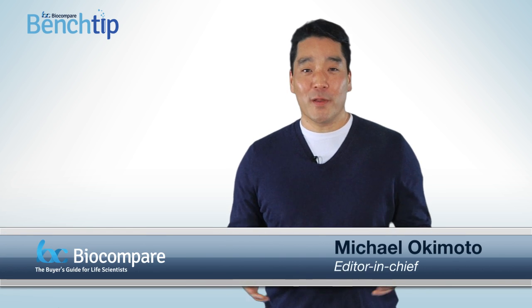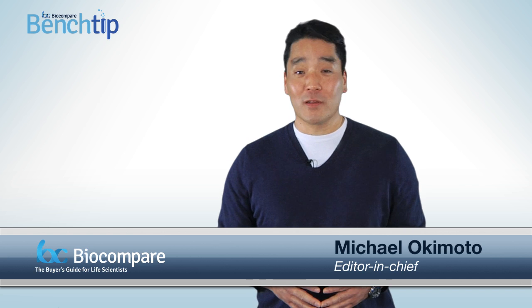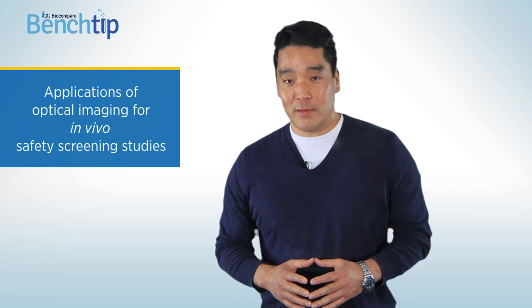As always, our video bench tips are a chance for us to talk about developments in the tools and technologies available to life science researchers. Today, we're going to be focusing on the applications of optical imaging for in vivo safety screening studies.